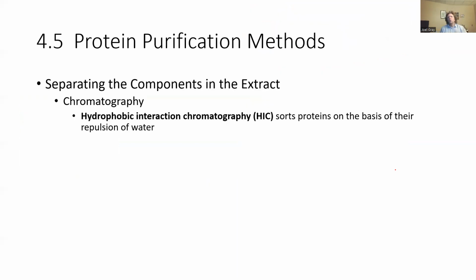So in addition to ion exchange, gel filtration, and affinity chromatography, there's also hydrophobic interaction chromatography, which is basically operating on the idea of how hydrophobic regions of a protein are going to interact with other hydrophobic regions. I would say that in protein chromatography, this is a little bit less common than the other three, but still this has value because you do work with molecules that have limited solubility in water. And so it is worthwhile and valuable to have this type of separation technique.